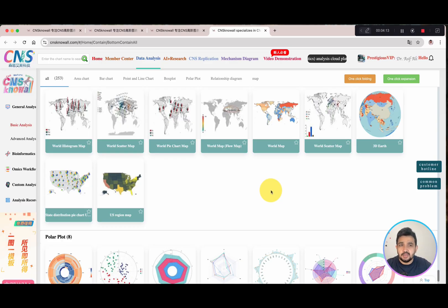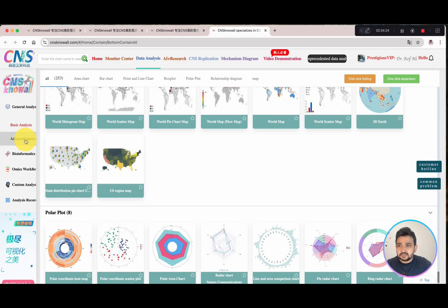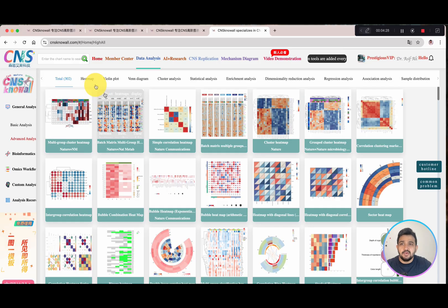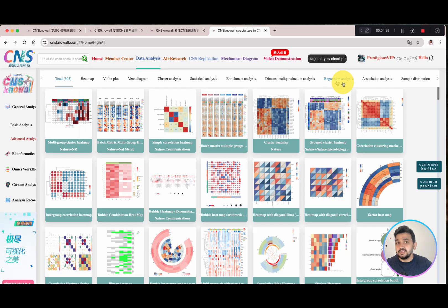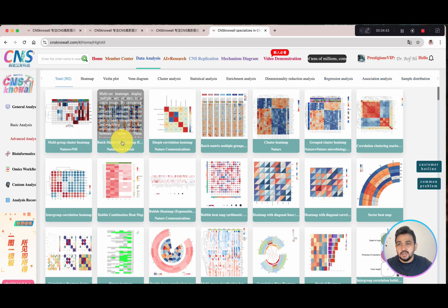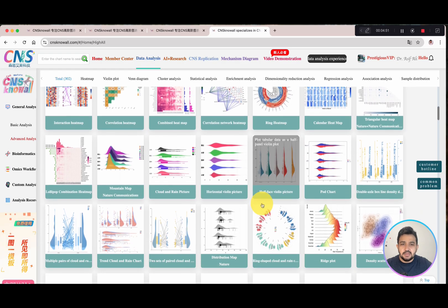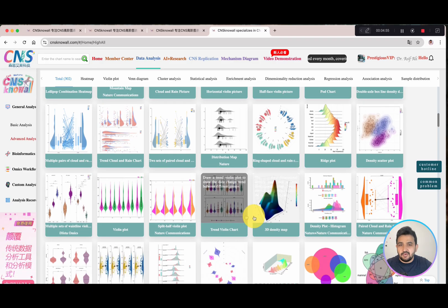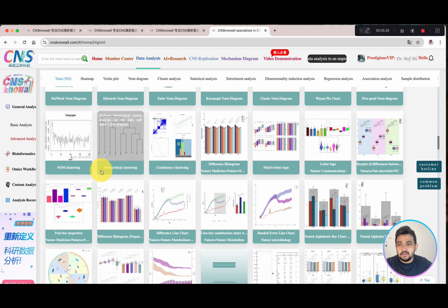This is something different — the previous web-based tools do not include any world map charts, but this one includes them. They also have polar plots. If we go to the advanced analysis section, we have heat maps, violin plots, Venn diagrams, cluster analysis, statistical analysis, enrichment analysis, dimensionality reduction, regression analysis, association analysis, and sample distribution. Even we have the Mantel test, ring-shaped cloud, and trend violin — it includes everything that can be required by any student or researcher.